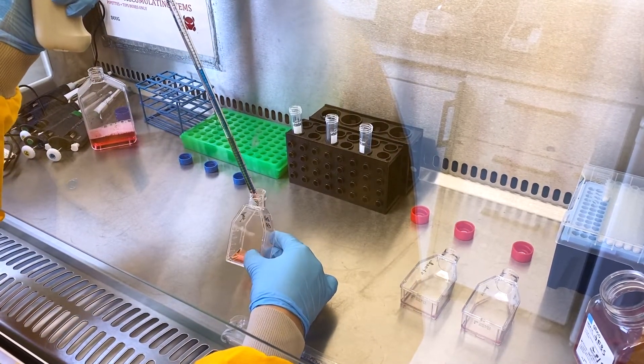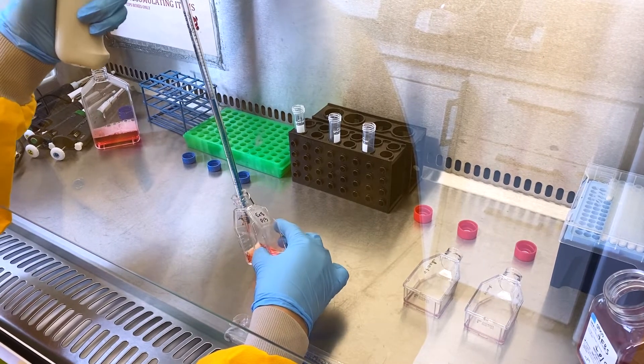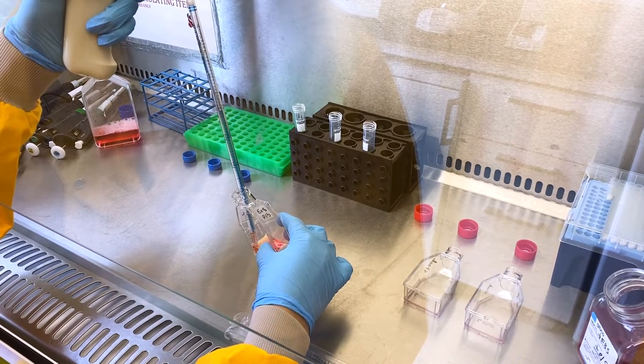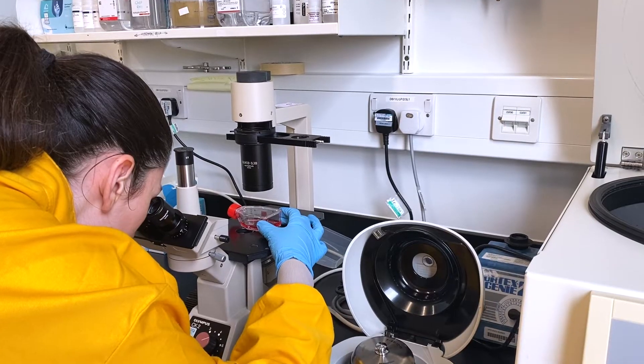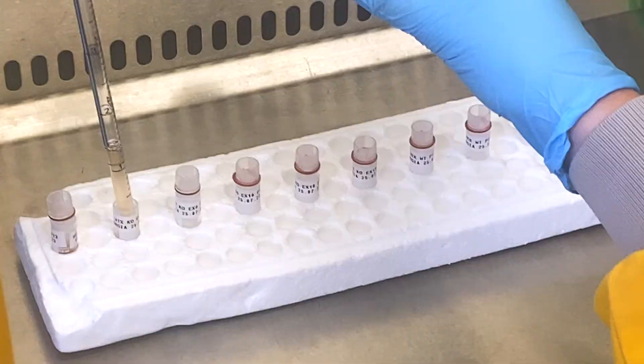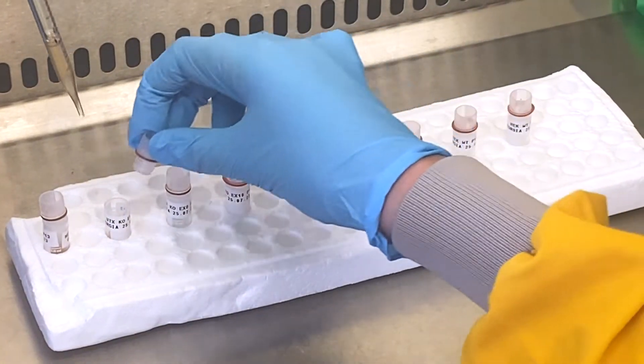This required high concentration and precision, as any interference with the samples could lead to their contamination, which would negatively affect our results. After the completion of cell culture, remaining cells can be frozen and then resurrected for later use.